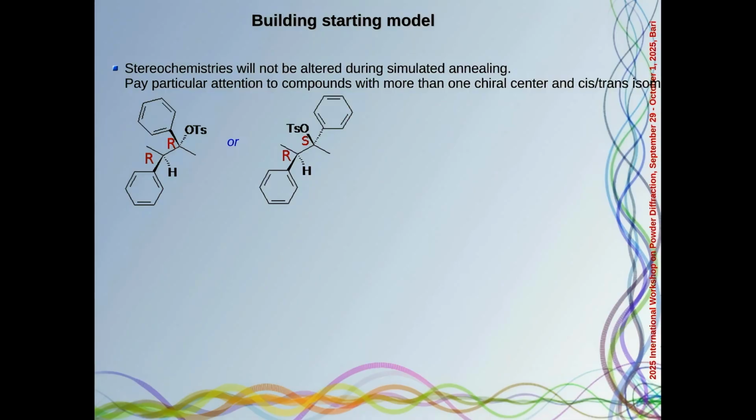Another approach that you can find in the literature is to remove the chiral center, for example by breaking two bonds. In this case, I have three molecular fragments, but I can add restraints to keep the information that these three molecular fragments are connected. And I could have the inversion of the chiral center, so I can use only one starting model and not two.